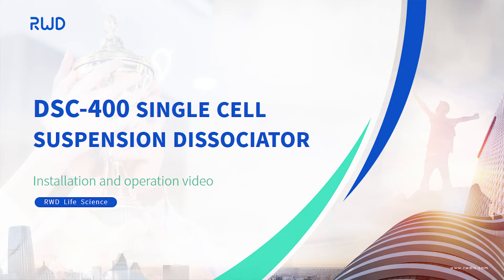DSC 400 Single Cell Suspension Dissociator Installation and Operation Video.